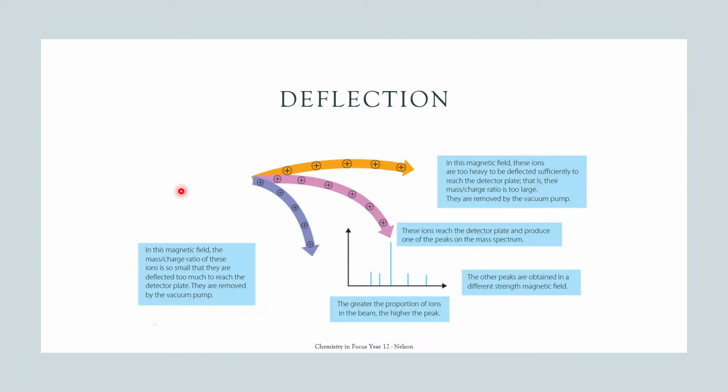So we can see this a little bit more closely in this deflection pattern that's here. Essentially, the one that's in pink shows all of the ions which have exactly the right mass to make the curve around. Lighter ions will end up being influenced by the electromagnet a little bit more strongly and get pulled further around than they need to be to hit the detector. And heavier ions are not going to be influenced by the magnetic field enough, so instead of going around the curve the right way, they'll just keep pushing forwards and crashing into the sides.